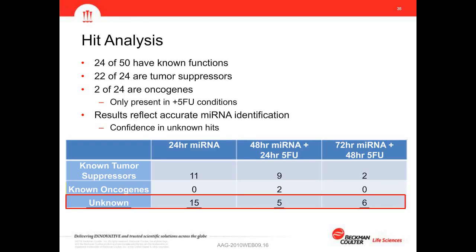So these could potentially be legitimate tumor suppressors or, again, other sorts of compounds or other sorts of microRNAs that could enhance 5-fluorouracil toxicity. And so, again, because we have the confidence in our data having been brought forward, we have the confidence to go back and, if we want to do some validation and hit validation experiments, we know that we should not have misidentified any of these and possibly be missing some sort of real needle in the haystack novel tumor suppressor due to identifying the wrong microRNA from our screen.